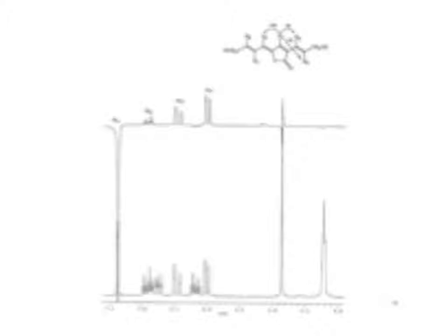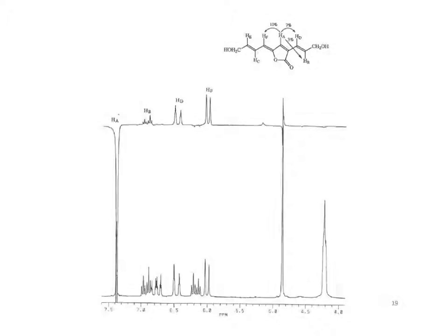Okay, so here's a few examples. So what happens is that the position that you irradiated gets squished, and then you subtract the reference spectrum from that, and so it ends up being negative. So we see that negative peak is the one that we irradiated.